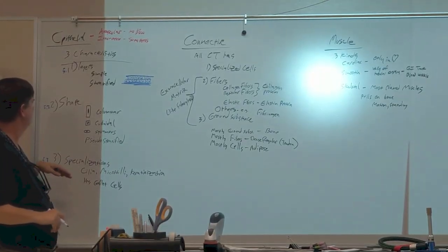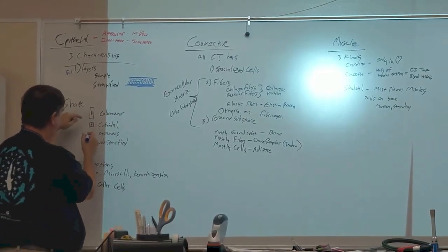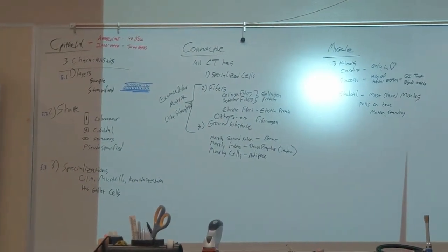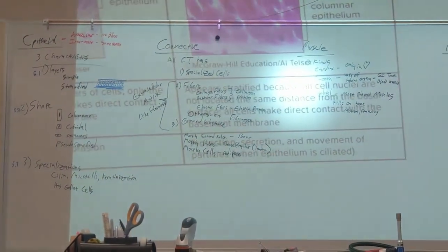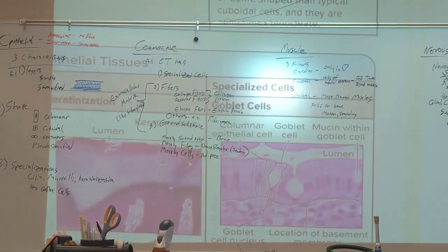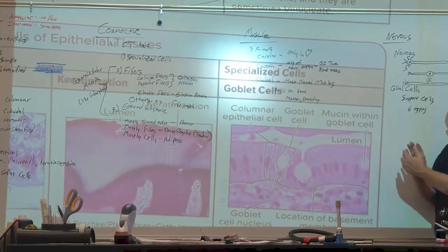The other thing we might talk about is the shape of the cells. If they're tall and thin and their walls are really close so the nucleus gets squished and looks kind of vertical, there's a picture of that in your book. Anyway, that's called a columnar cell. There's a picture of that in your table 5.3. You see how those cells are tall like architectural columns and the nucleus is squished real narrow?